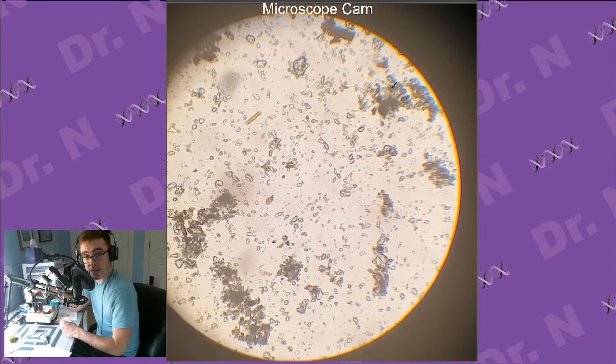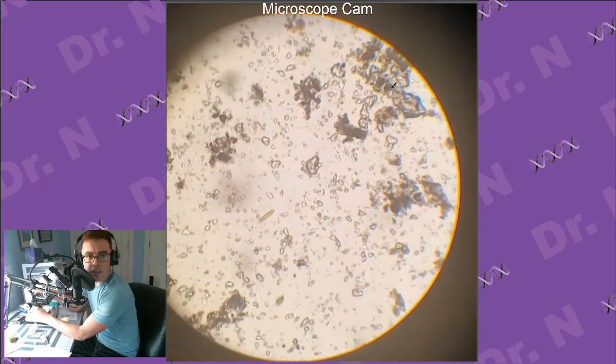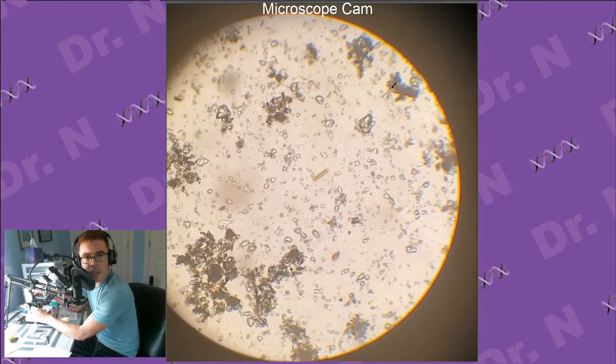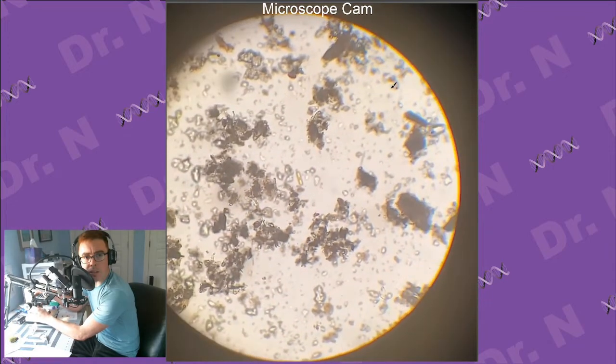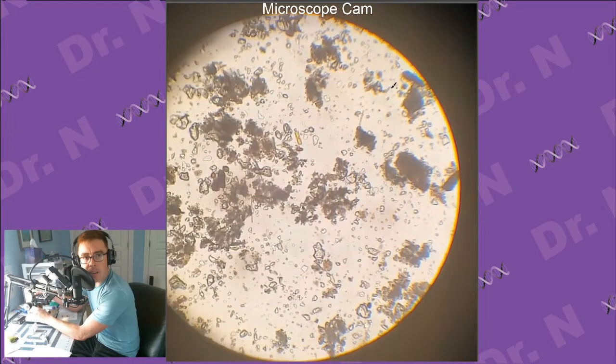Well, it's dirt. That's for sure. Oh, there is something right there, though. Right away, one of those rod-shaped guys. Pausing to see if I see any movement. Not quite. So this is not the highest power I can go. Oh, there's something there, too. Yeah, it's easier to see the ones that are green.